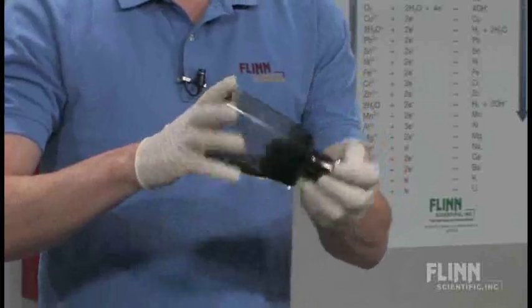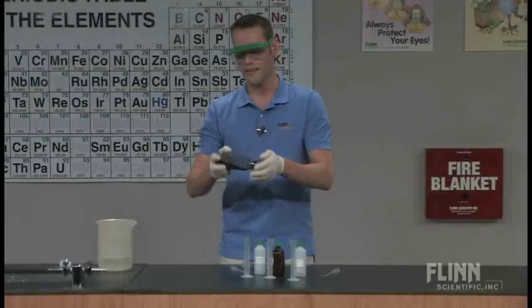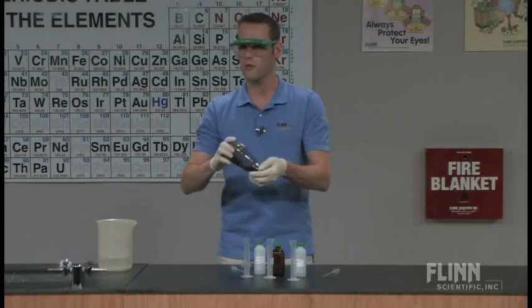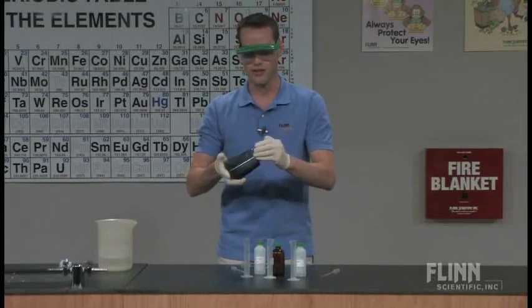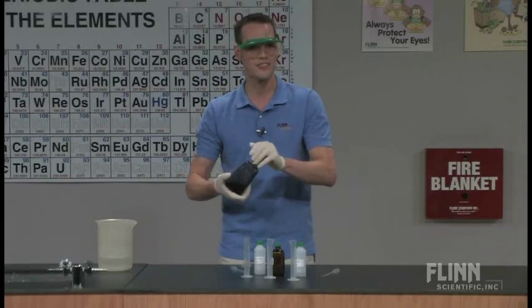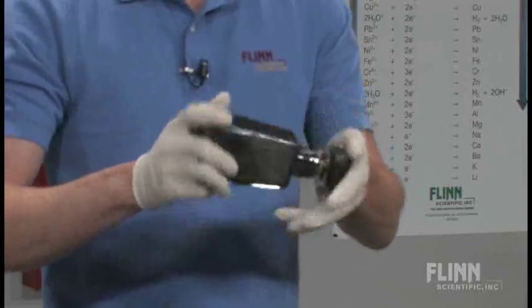And this has gone around the school so the kids know when they take advanced chemistry that this is going to be happening right before holiday break. So they really actually look forward with a lot of anticipation to doing this activity. They actually sometimes ask me in the first week of school, hey, are we going to do that this year too? And so there's really a dramatic, beautiful reaction.